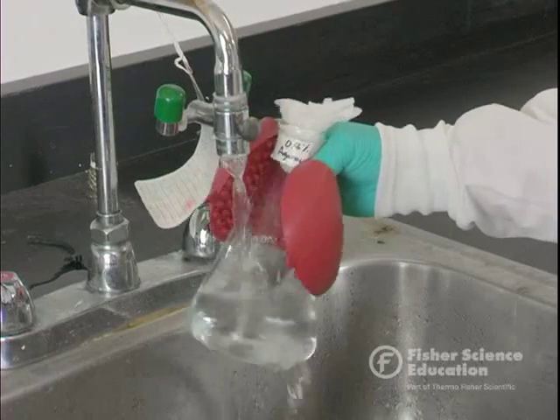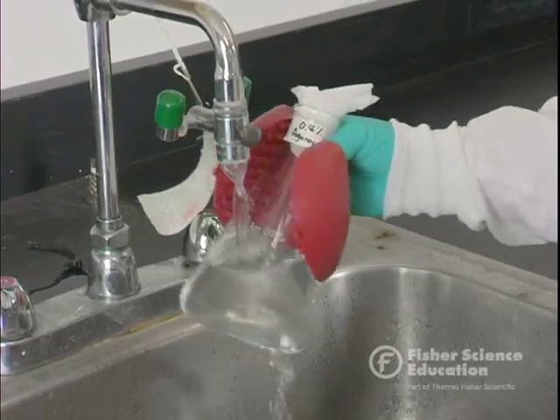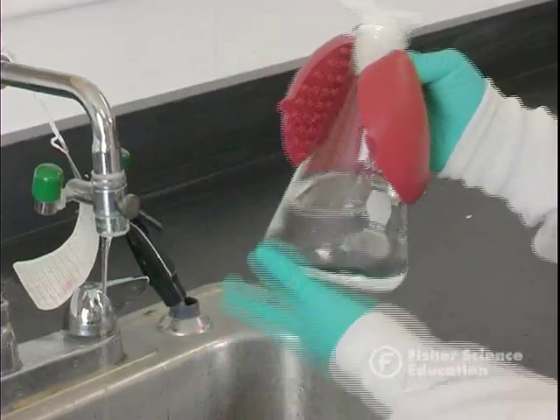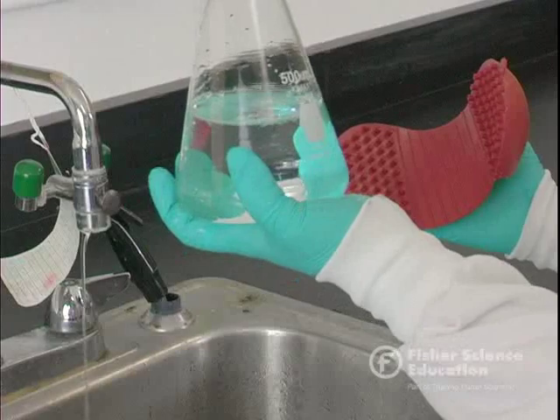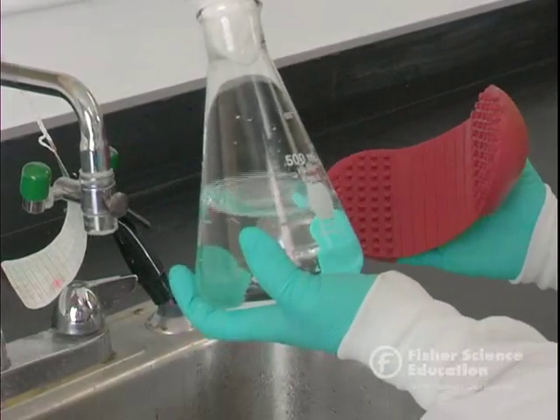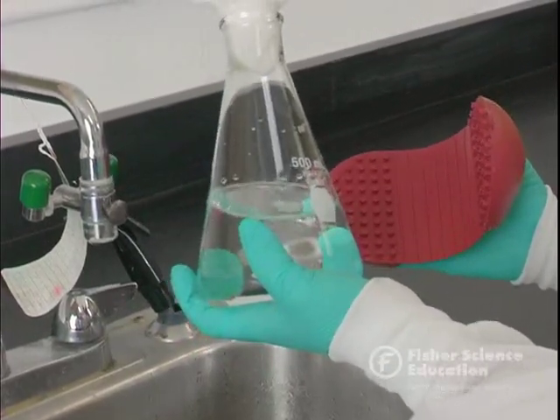Depending on the size of the batch, cooling will take anywhere from 30 seconds to several minutes. Once finished, turn off the water. You can now hold this in your hand — you can see it's still warm but not burning me — so we're at the right temperature to pour into our casting trays.